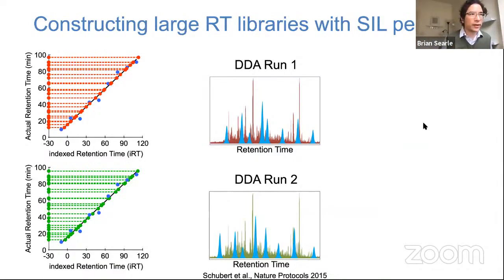Now, Hugo asks, how many peptides do I need for our standard? Honestly, I think that the IRT standard is around 10 peptides. The PRTC is around 12 peptides. Something in that range is just fine. Digested, as I said, just taking enolase and digesting it, or taking albumin and digesting it, and then putting it into your sample at a certain small ratio is enough as well.